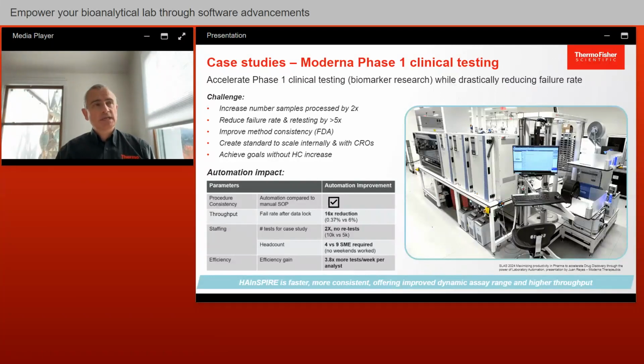The hypothesis that we're testing is, well, can we automate this such that if we do want to scale up the frequency of the trials, we can make another one of these systems and validate it. And validating a system like this is a much shorter process in time than actually building a new lab and the various training that will be necessary and equipping that will be necessary to do that. So they were testing the hypothesis that they could scale using automation.